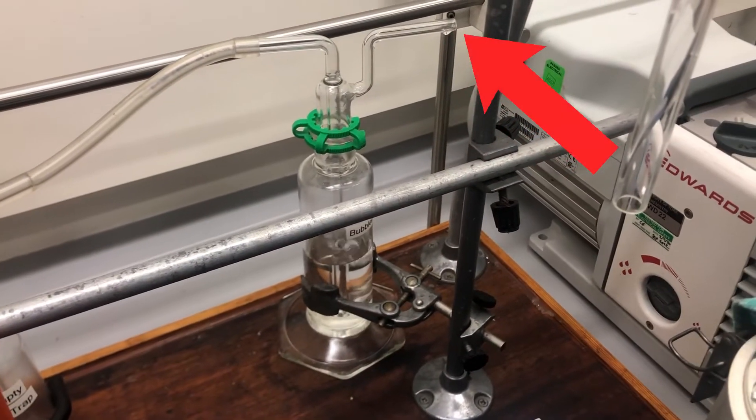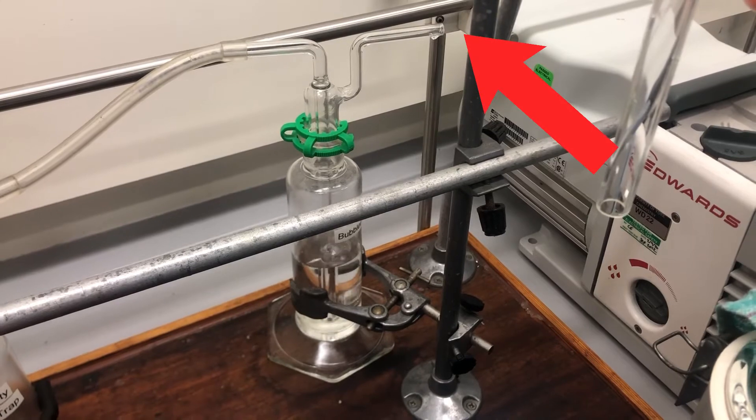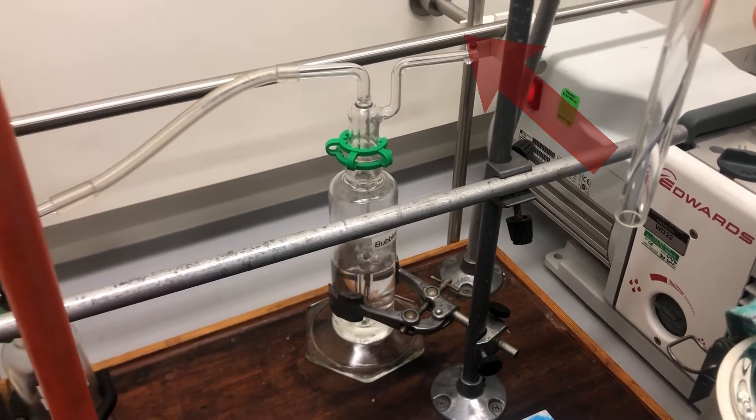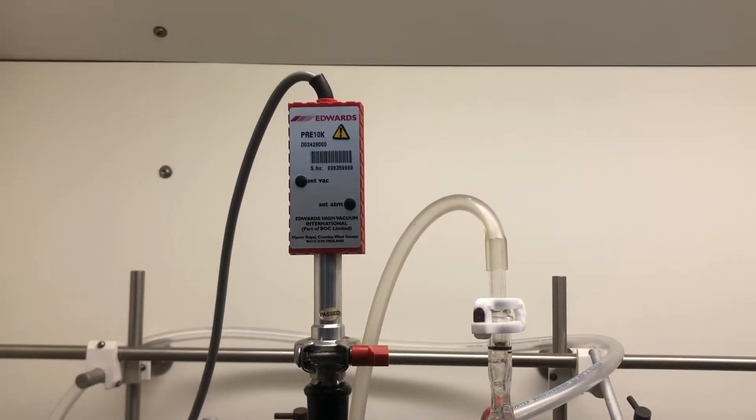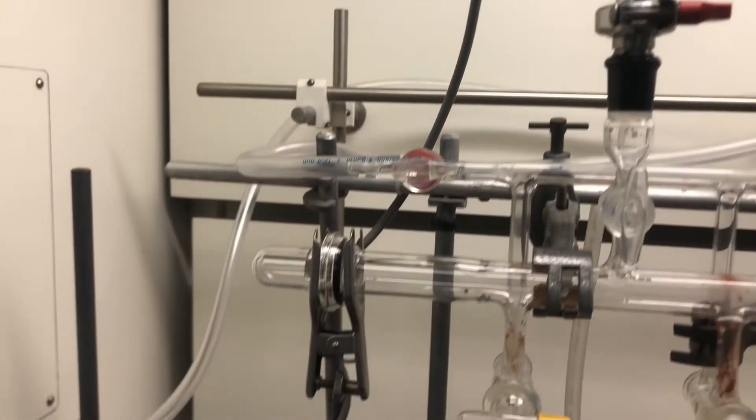That really is like the pressure gauge for our nitrogen manifold. Faster bubbling means higher pressure of nitrogen. We have our vacuum line here as well, which is also attached to a Pirani gauge, which is our pressure gauge.